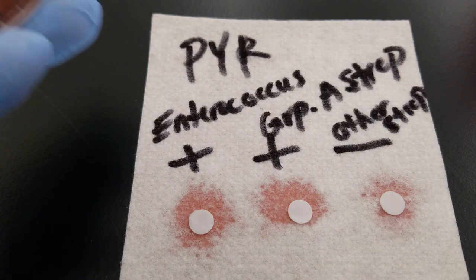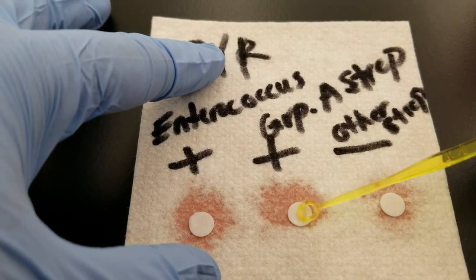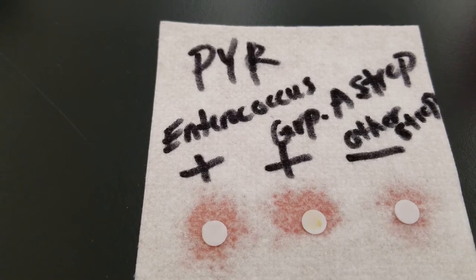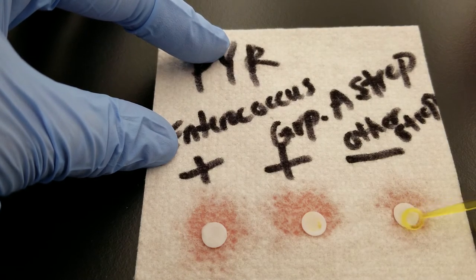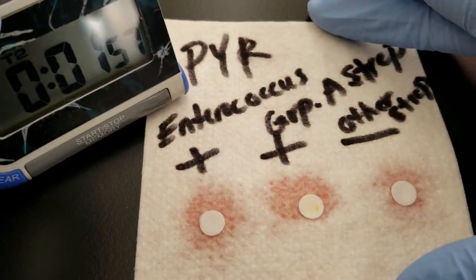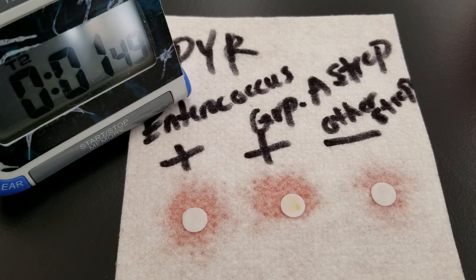We're going to get another loop and this time do Streptococcus pyogenes — very beta hemolytic. Again, two to three colonies, put that on there. The next one we're going to do is any Streptococcus other than pyogenes; I'm using Streptococcus agalactiae, which is Group B strep. So we have those on there and we're going to let them sit for two minutes so the bacteria, if they have the enzyme present, will be able to hydrolyze that substrate in the discs.